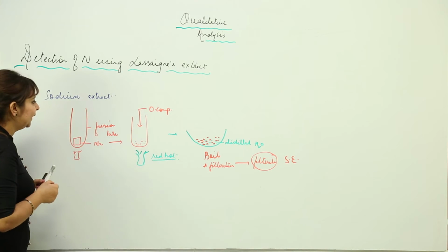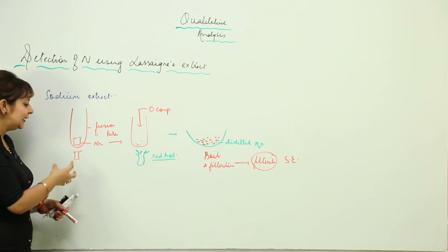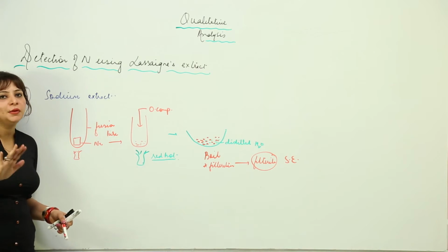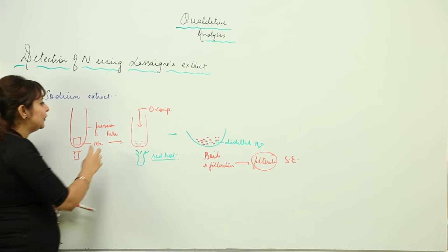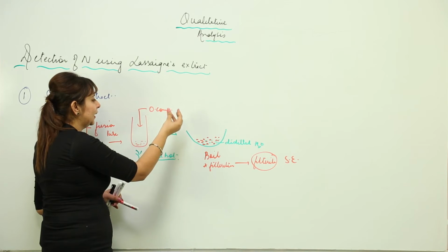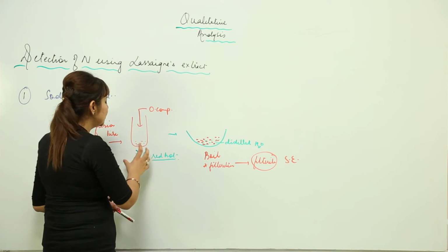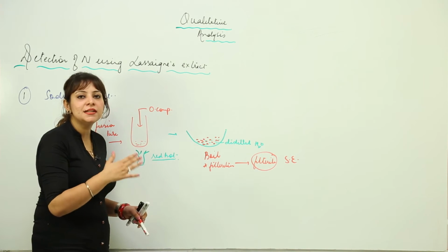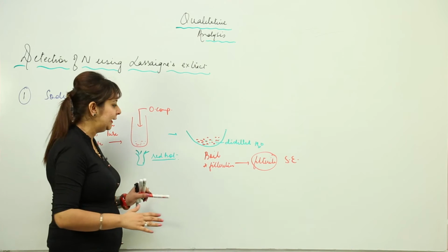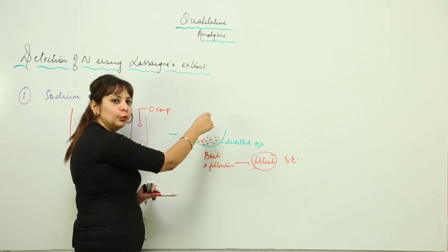Again, what we did: we took a fusion tube in which I took a sodium piece. Then I heat it so that it gets melted. The heating is required only till the time it melts. Then we add a pinch, or a little more than a pinch, of organic compound, and then you start heating it. We heat it till red hot. When the fusion tube becomes red hot, we stop heating, we take a china dish in which there is distilled water, and we break this tube in it, right?